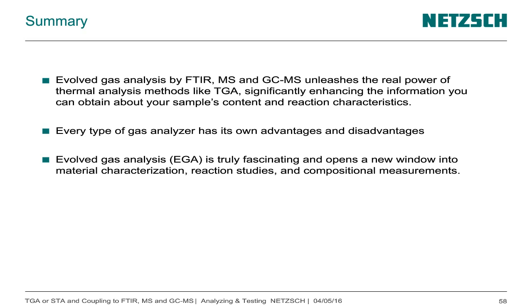If you do not have one and want to know whether a gas analyzer is suitable for your problem, the best database I know on the net is the NIST Chemistry WebBook. If you want to see mass spectrum fragmentation and mass numbers, or FTIR, and whether you can detect things or whether we have an overlap, please go to the NIST WebBook. Otherwise, you can also send me an email.